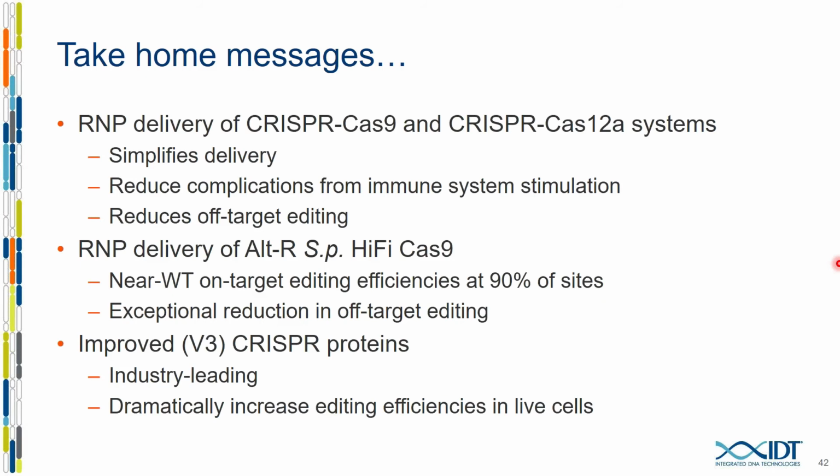Great, thank you. We've gotten a couple variants of this question. What changes were made between V1 and V3? Were they adding more mutations or optimizing expression or purification protocols or NLS, etc.? Okay, so what I can say about those is we did not make any additional substitutions to the native ORF. These are changes to the region's flanking tags, linkers, and nuclear localization signals.